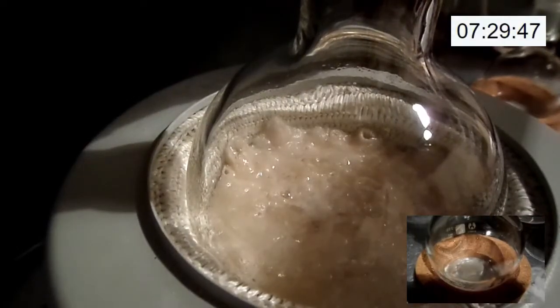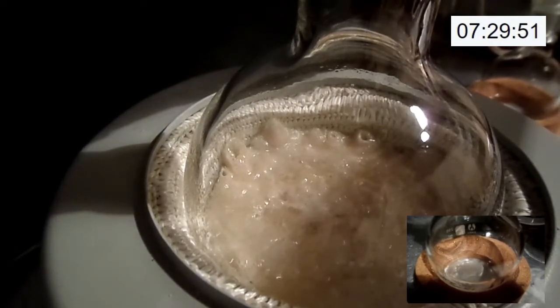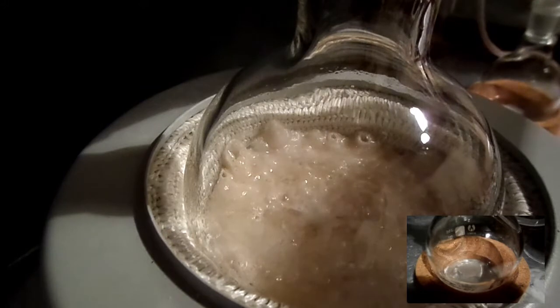At this point we would expect to begin collecting our benzonitrile product by distillation. However, benzonitrile boiling at 191 degrees Celsius is so close to the reaction conditions that very little actually distilled over.